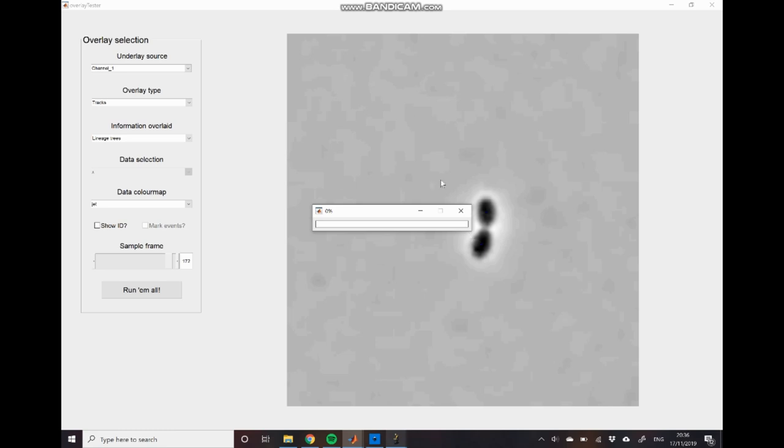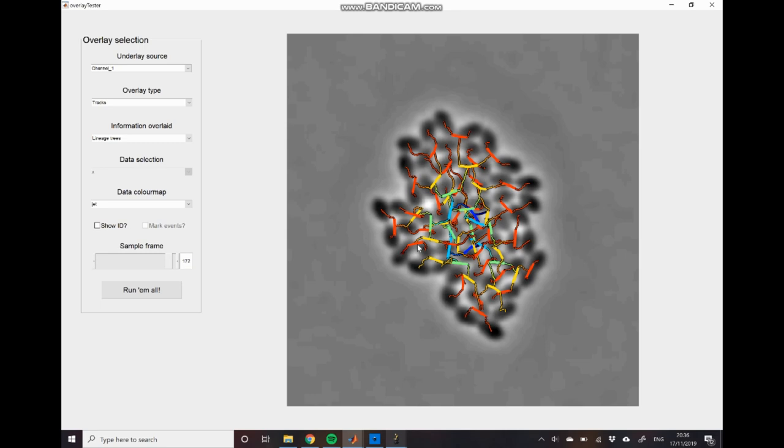It will now perform a reconstruction where it shows you all of these division events occurring at once. And so you can see here that we have our initial two mother cells marked out in blue. These undergo divisions repeatedly. So we go from 4 to 8 to 16 to 32 and finally to 64 in the dark red.